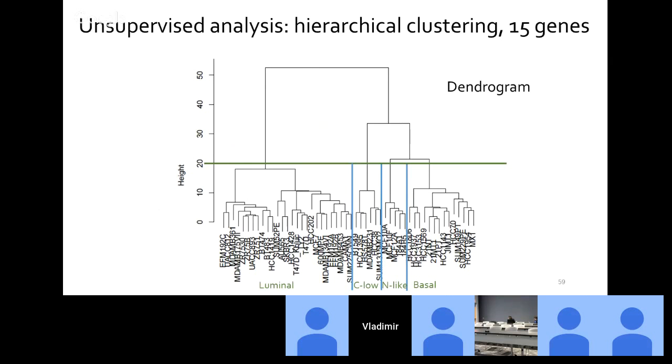So currently, it's not clear how these 15 genes we're looking at were selected, but let me just tell you that they were also selected automatically. So in fact, no initial biological insight was used for this selection. In many cases, it is an iterative procedure.